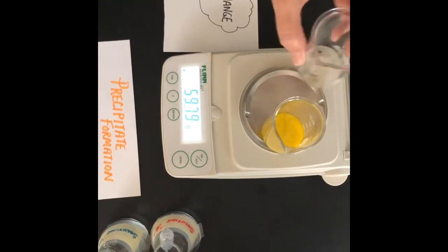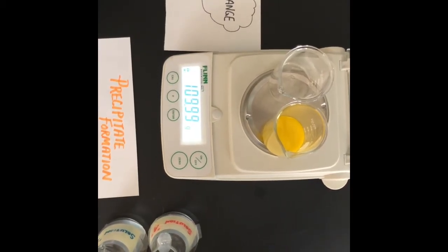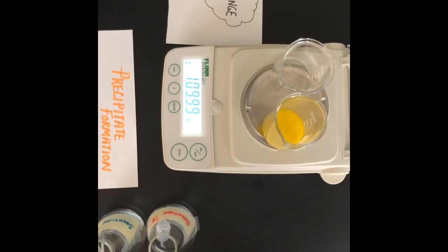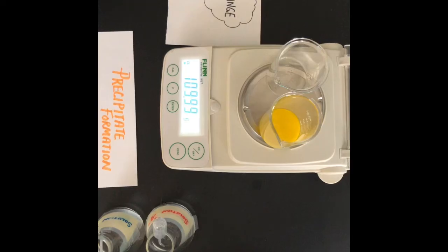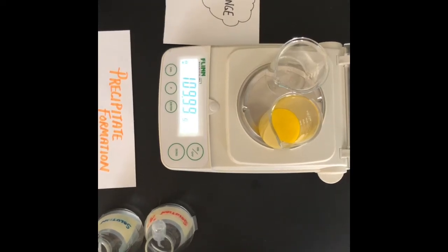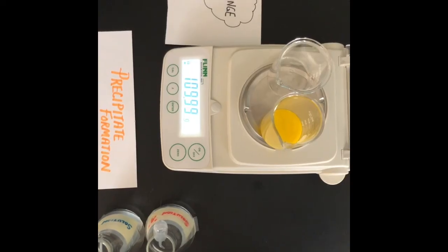Uh-oh, I must have done something wrong. It changed yellow. What you see there is known as a precipitate, and while that looks like a liquid, it is actually a solid. Notice that the mass has not changed. It is still 109.99 grams.